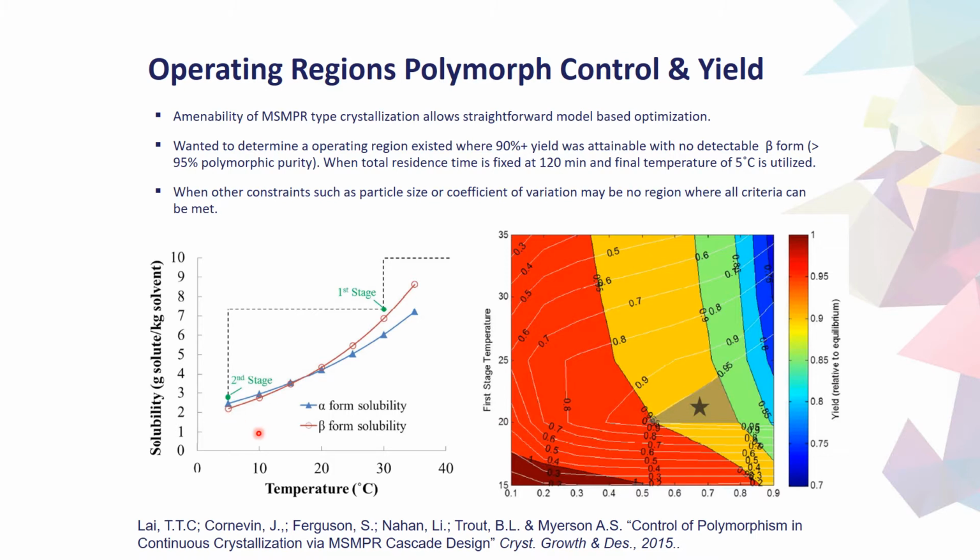So previous batch crystallization study demonstrated how difficult it is to produce the beta form of para-aminobenzoic acid through batch crystallization. So the primary nucleation kinetics are very slow for the beta form of para-aminobenzoic acid, and very difficult to isolate as a batch from a batch crystallization.